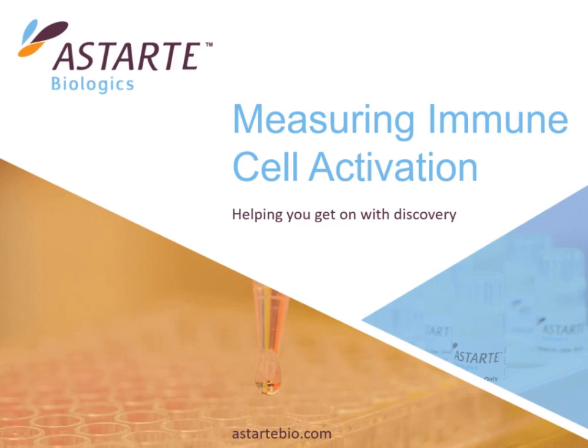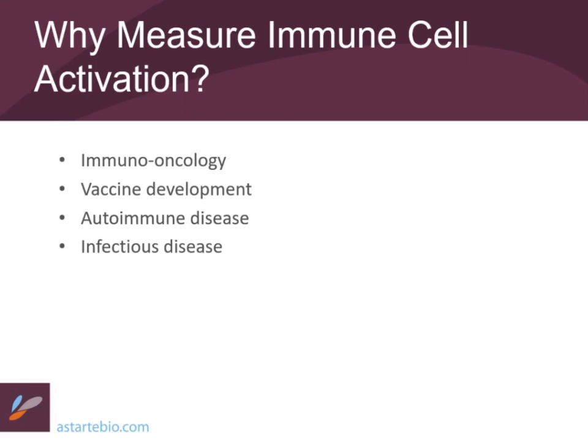Thank you for that introduction and welcome to the webinar. A pleasure to speak with you all about immune cells and different assays we can use to measure immune cell activation. And of course, the first question is, why would you want to measure immune cell activation? The obvious one is that immuno-oncology has become a very hot area of research. It's bringing new treatments to bear on a variety of cancers. And the excitement in this area is spilling over to vaccine development, treatments for autoimmune and infectious disease as well.